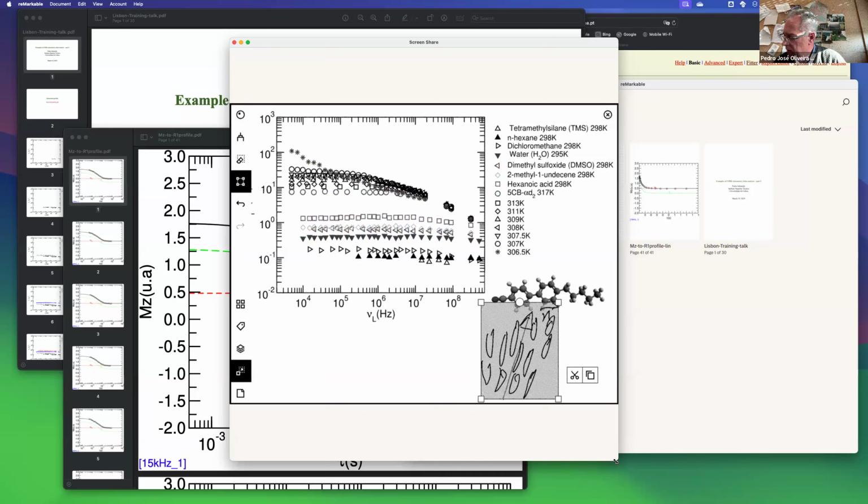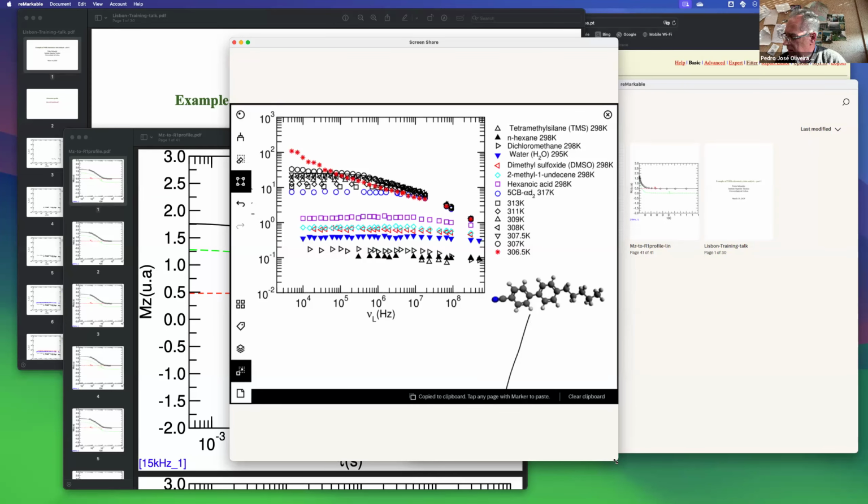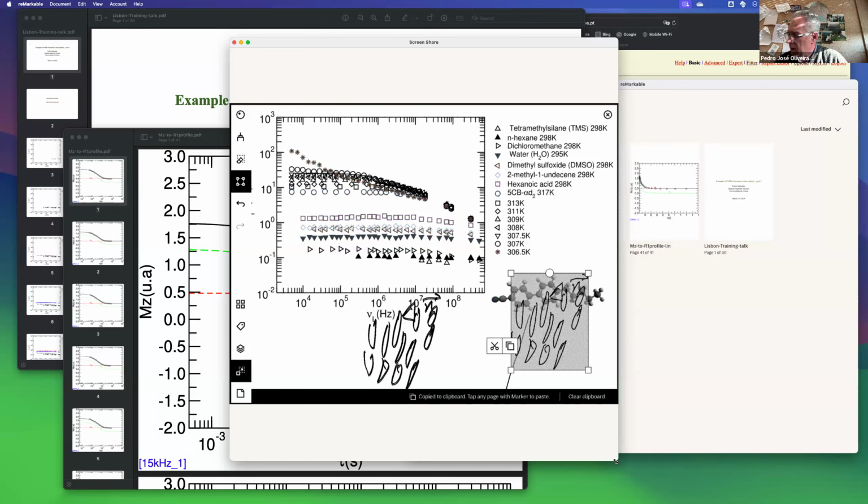Okay. In this place, the molecules will have a copy. So in this area, the samples will have this direction, but in this one, the direction could change. So the direction of alignment of the molecules can change from one region to the other in space, but the common feature is that they are aligned.